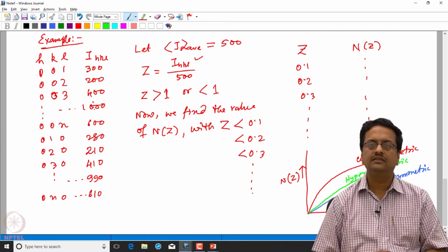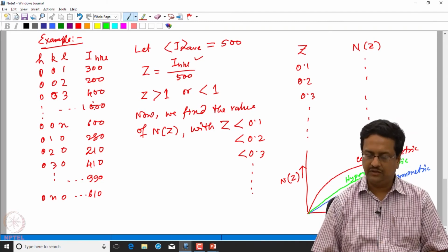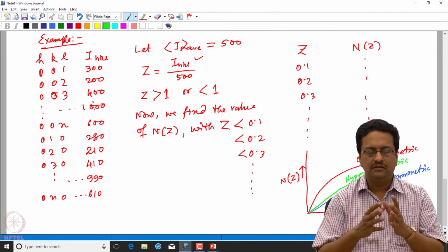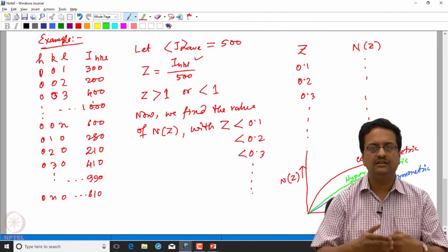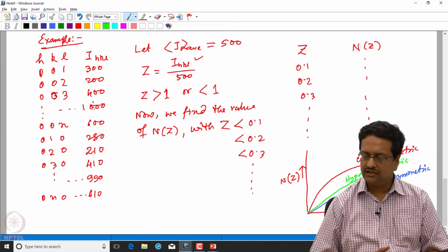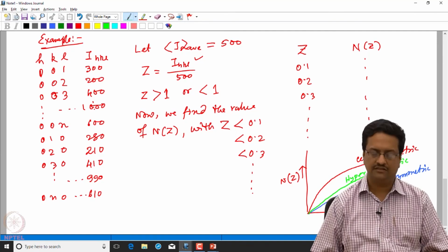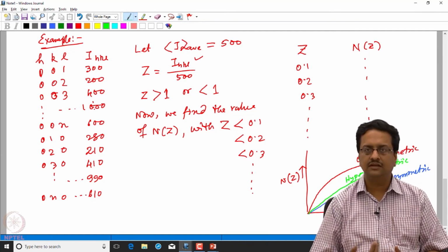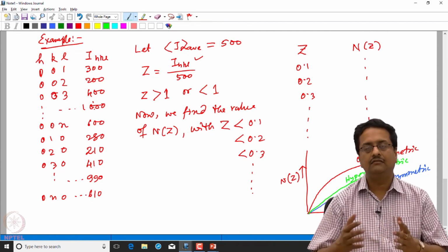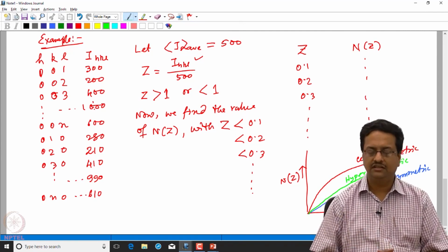So in this lecture, we have learned how to identify from the intensity statistics the correct unit cell parameters, how to identify the correct Bravais lattice, that is the correct crystal system, whether it is monoclinic, orthorhombic or tetragonal or anything of higher symmetry, and then we tried to understand how one can identify the presence of an inversion center in a crystal. So in the next lecture, we will discuss the study of these IHKL values, from which we can then identify the presence of twofold and mirror symmetry in crystal structures.